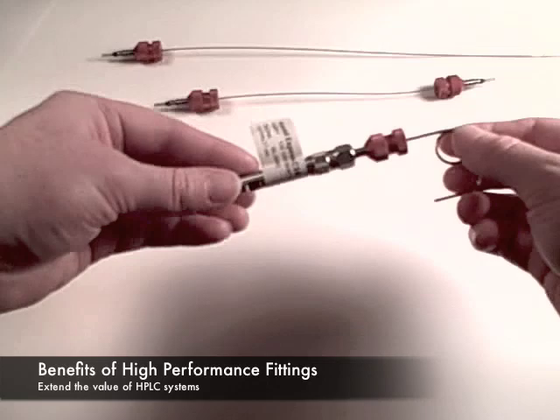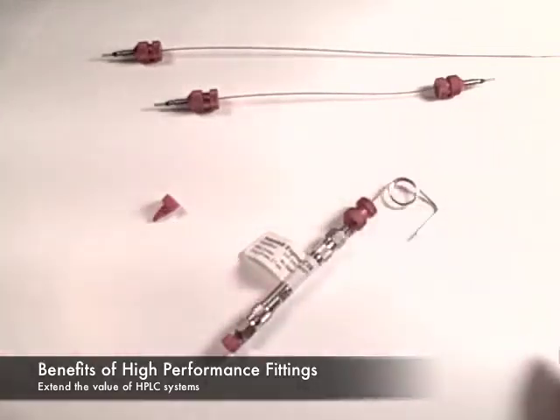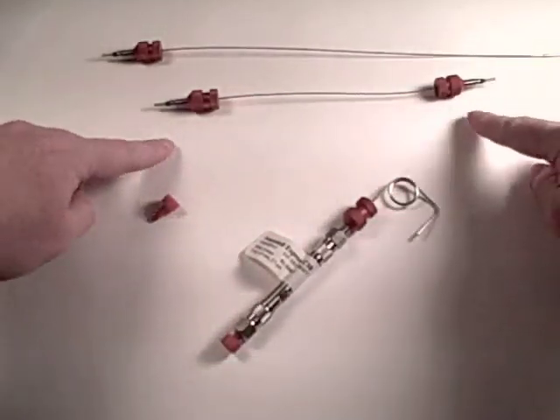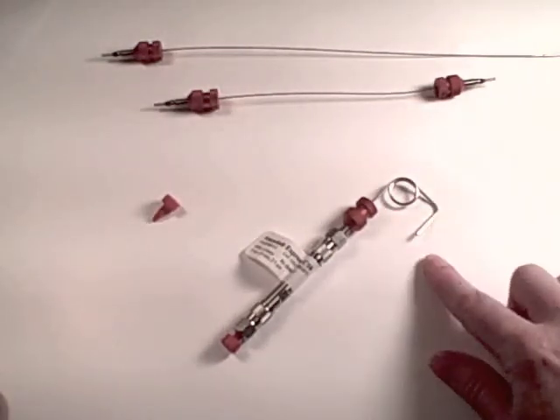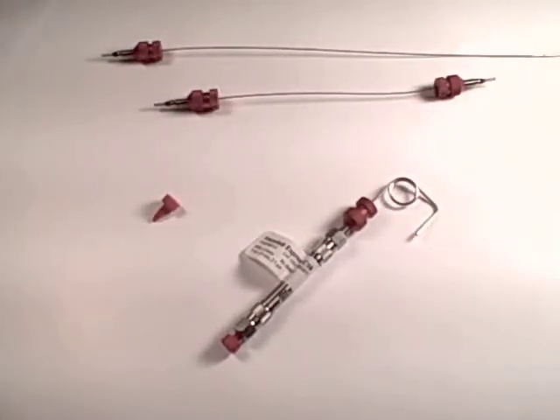Supelco high performance fittings are available in many lengths. They are also available in double ended and single ended design and for instrument connection. Go to sigmaaldrich.com and keyword search high performance fittings for product information, or contact a technical service representative at techservice at sial.com.